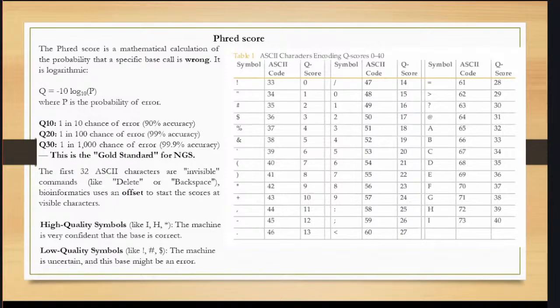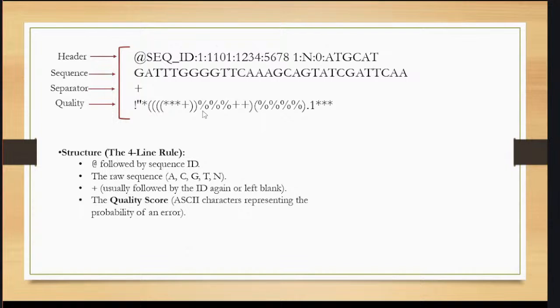So, is everyone done with it? Should I answer it, or does anyone want to boggle their mind? I'm giving a hint that there are 4 lines in FASTQ, and it is fixed. There are 4 lines in FASTQ.